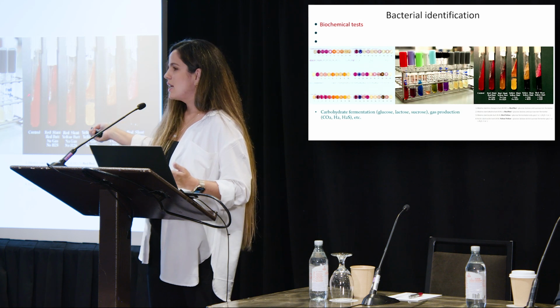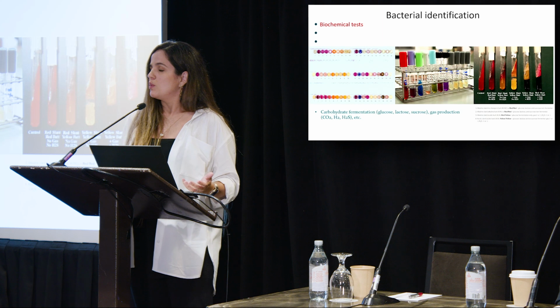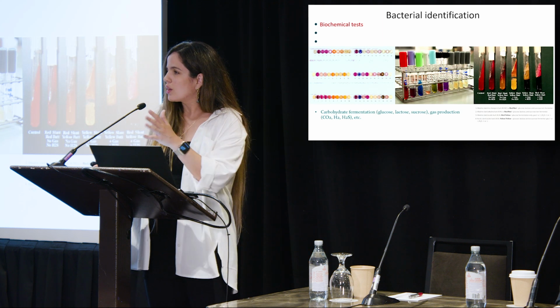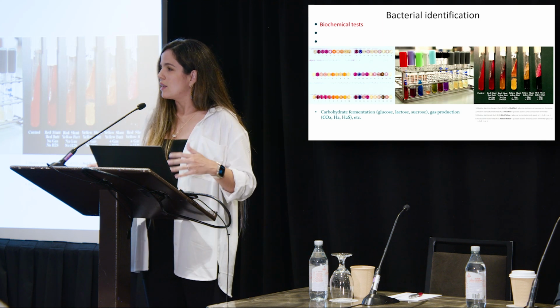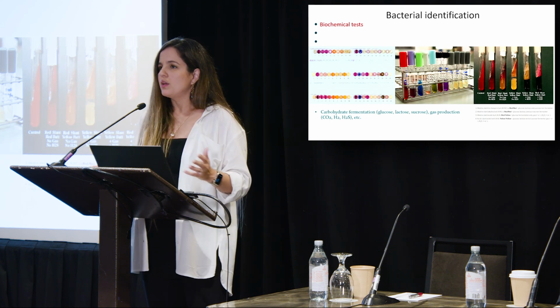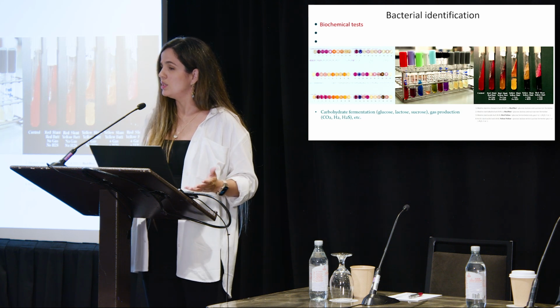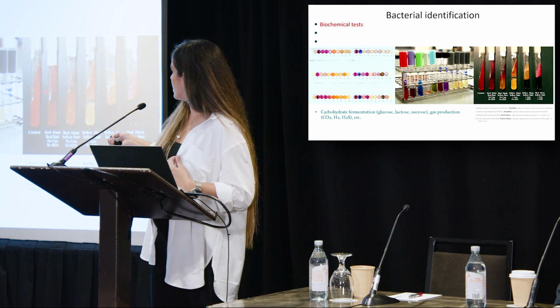We can also check if these microbes have motility. This is important. Most of the pathogens are able to walk through the gut. So they can walk through the mucus layer, they can walk through the cell layers. They have the capability to do that, right? And then we can see that on the agar as well.